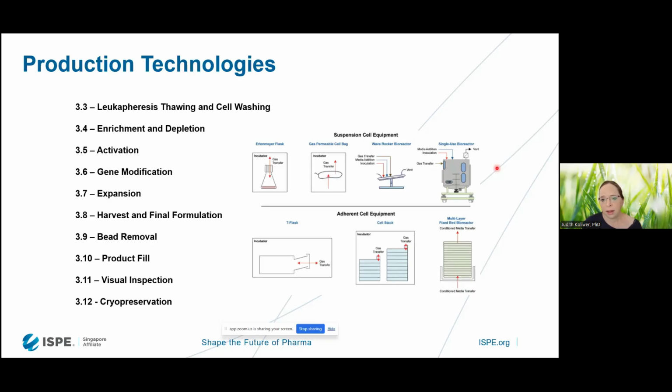Main consideration here that we made, one that we found really important, is the cell phenotype. So the NIH published, I think 2 years ago or something, a very interesting publication about the difference between cell bags, flasks, and single-use bioreactors, and how the selection of the equipment actually influences the cell phenotype. And of course, the cell phenotype, for example the maturity of the T cells, very much affected their therapeutic treatment and their therapeutic success.